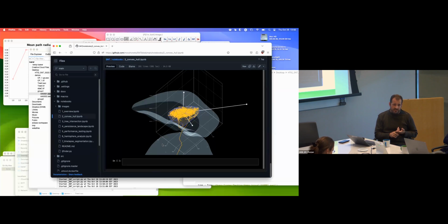People like it, but they hate installing. Everybody freaks out with installation of PyImageJ, and then the imports are clunky because you have to use the Java classes. You have the camel case thingy. People get upset by it, but once they have it running, then they don't complain. But the script editor, I think the reason is, I don't know, but Python 2 is annoying because some things are different, the parentheses and stuff, and so people just stop writing and then they say it doesn't work.